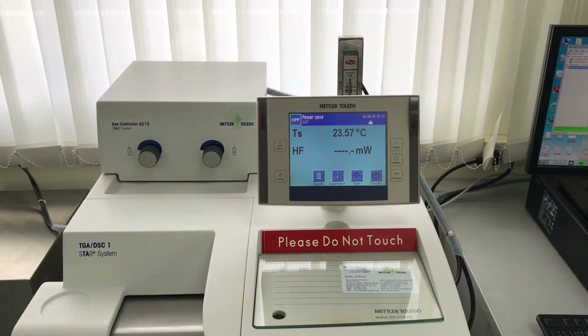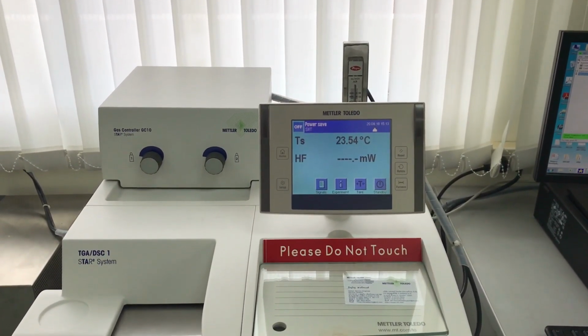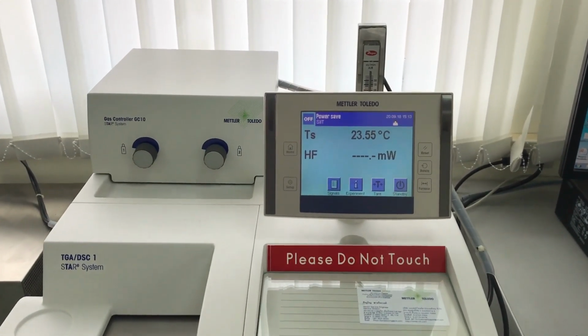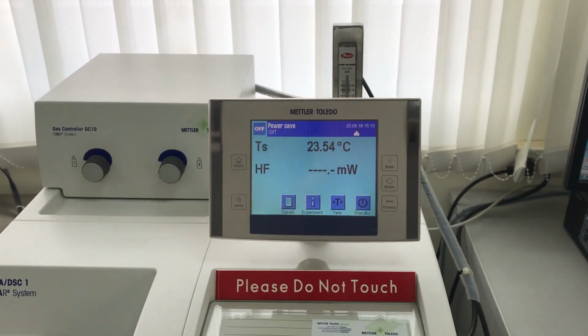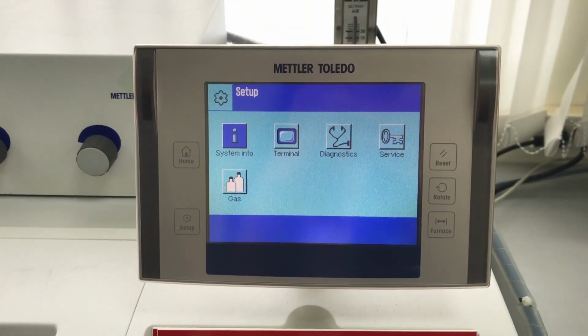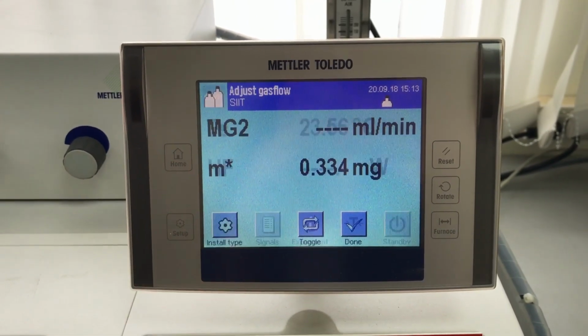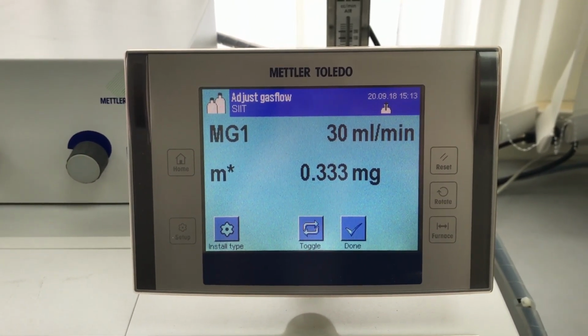Before we put in the sample, we must set the flow rate of the gas to a desired value. In this experiment, we will use 30 ml per minute. Press set button and touch gas button. MG1 is for nitrogen.